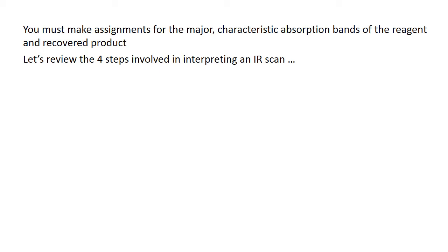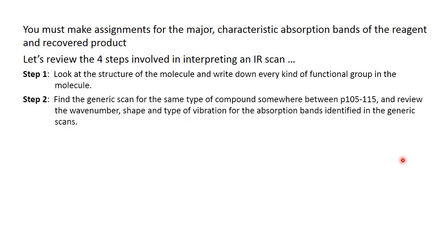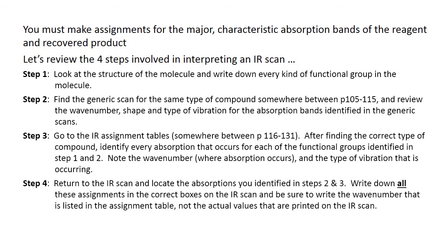So once again, you must make assignments for the major characteristic absorption bands of the reagents and recovered products. And since this is now the 5th video, I won't read this. You can pause the video here if you want to review them before we continue.